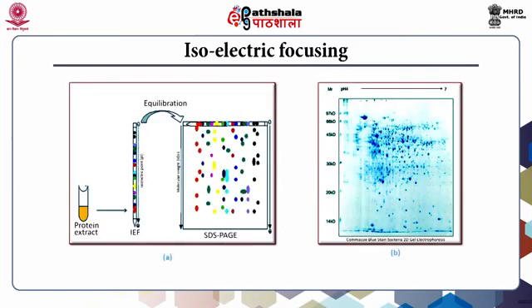Two-dimensional electrophoresis is an advanced method of protein separation where the separation of the proteins on a gel is conducted in 2 dimensions. It involves the combination of isoelectric focusing with SDS PAGE to obtain protein separation with a very high resolution. The sample to be purified is first subjected to isoelectric focusing as described in the previous session. For the second dimension, the gel is then subjected to SDS PAGE electrophoresis.